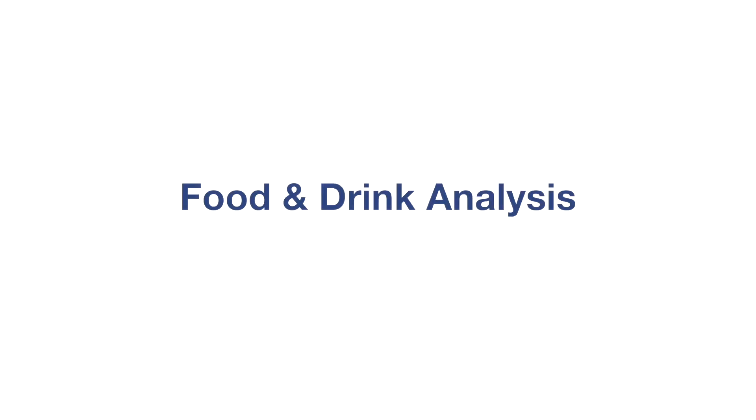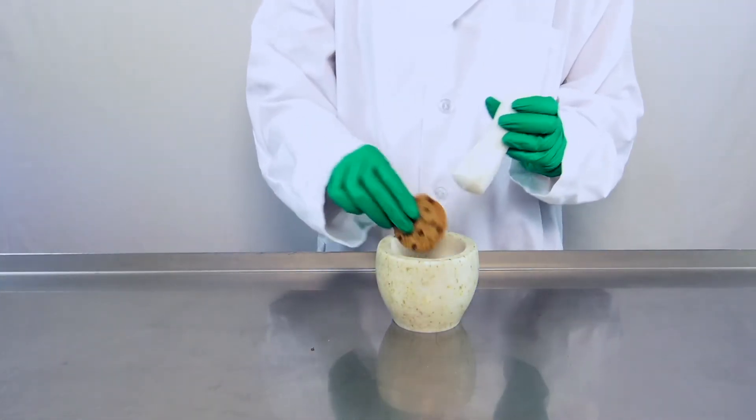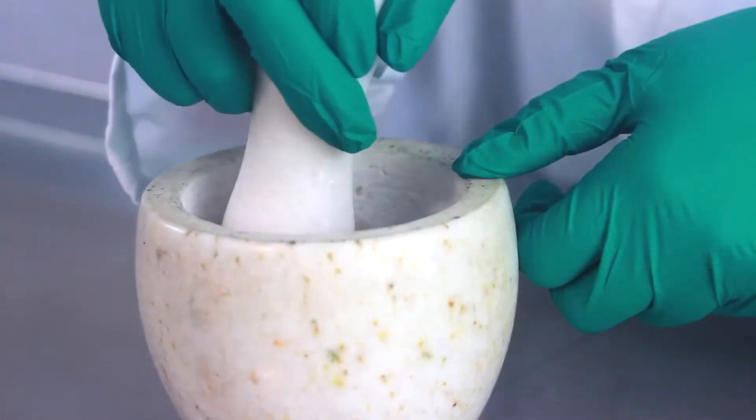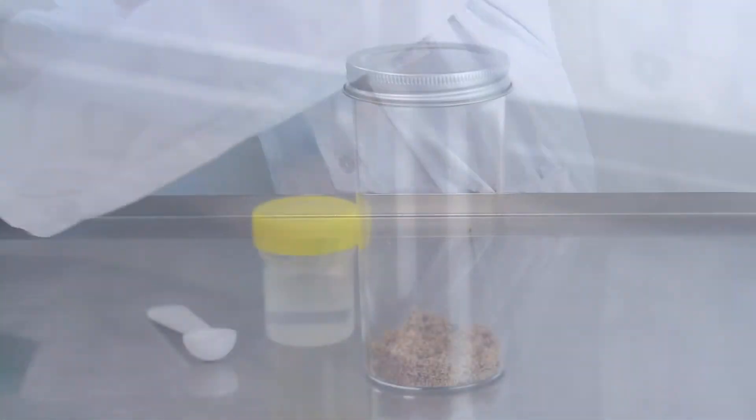Food and drink analysis. For solid food samples use a clean mortar or mincer to break down the sample. Grind to find crumbs. If your sample is a liquid or doughy texture, refer to the manual.